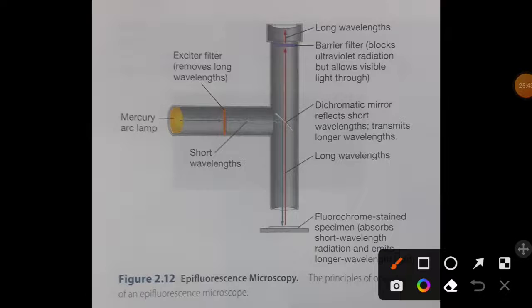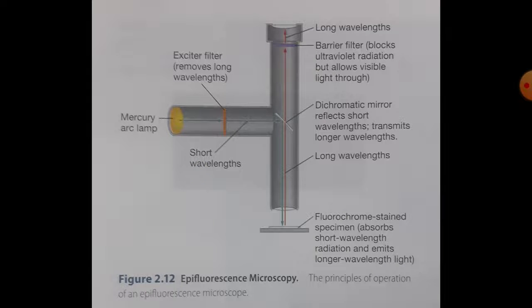So now you tell me, are we going to stain those photosynthetic microorganisms? No, because photosynthetic means that the microorganism possesses chlorophyll, right? And I have told you at the very beginning of that lecture that chlorophyll is a natural fluorescent dye. So we do not have to stain them. For other microorganism detection we have to stain them. We will discuss various staining techniques. So that is how epifluorescence microscopy works.